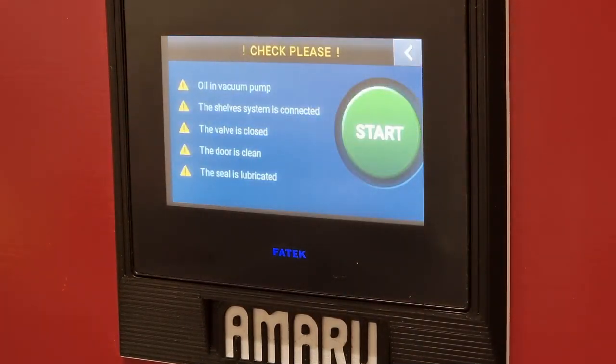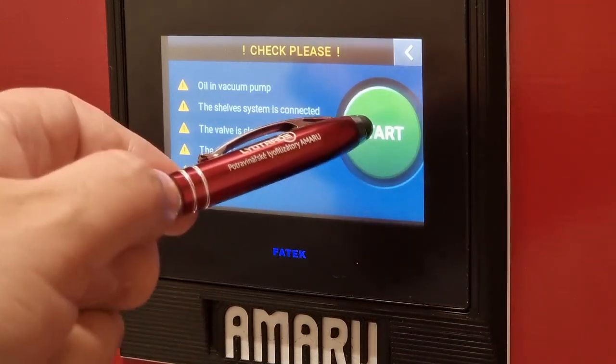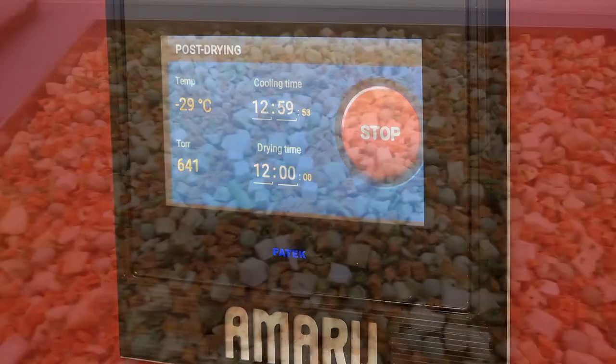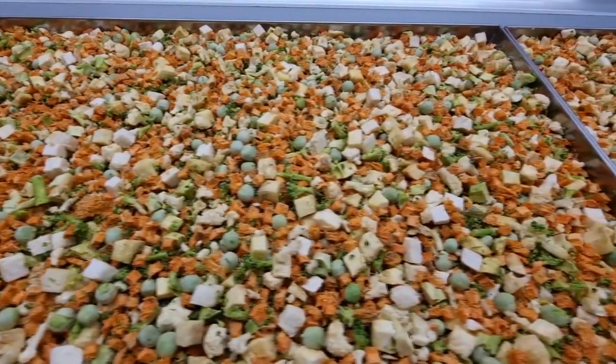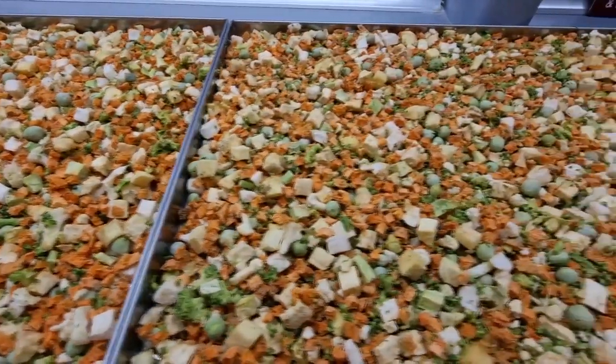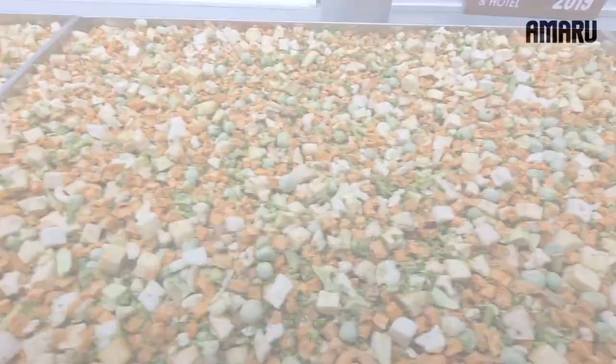The drying function is designed to save imperfectly dried product. In practice, it's certainly advisable to start with a longer time and reduce these times with each next identical loading. The product will certainly look better if it's dried in one process than if it's dried additionally.